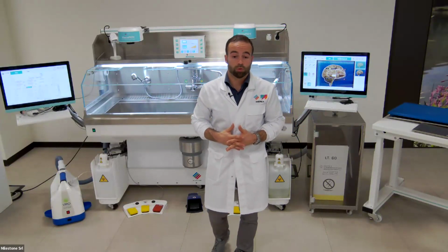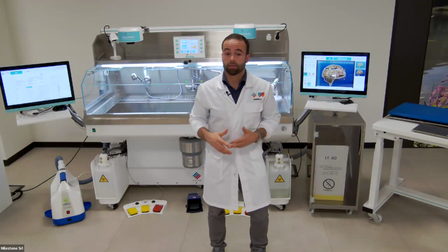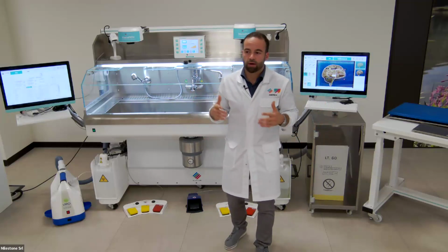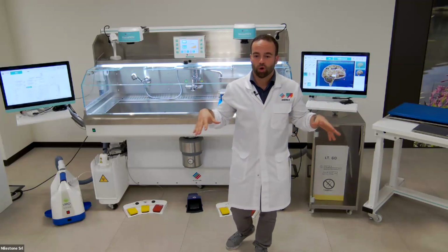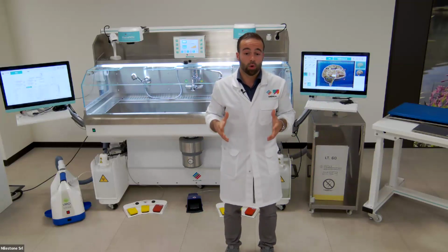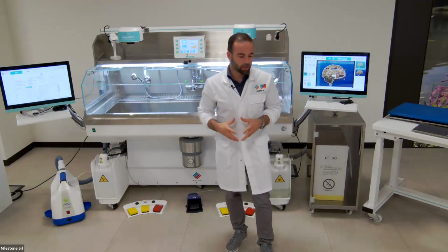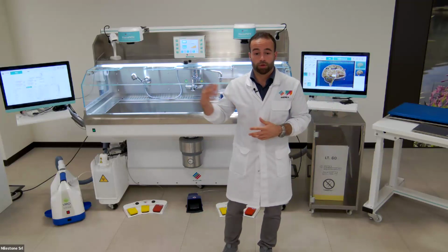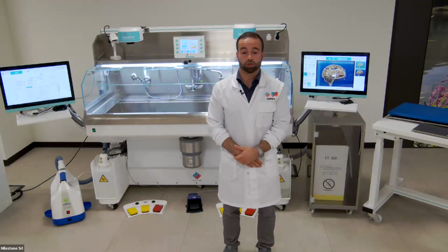It's possible, for example, for teaching purposes. If you have a big classroom of 20 people, it's difficult to manage all of them in a laboratory, which notoriously is small and lacks space. So this is a powerful tool also for teaching, also for a second opinion. Yeah, definitely it's possible.